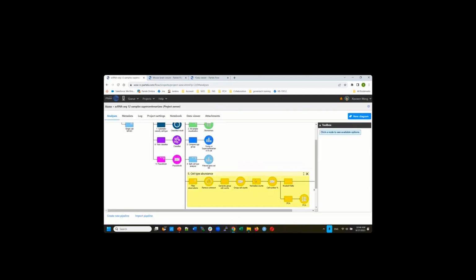Now, if I want to perform statistical tests to see if this holds, since you have replicates, if you want to perform statistical tests at a sample level, you have to have replicates. If you only have one sample, then you cannot, right? But when you compare the cell number, you will say, what if in this sample I sequenced more cells than the other? So you definitely want to normalize that. And proportion usually is a good way to look at the percentage, right?